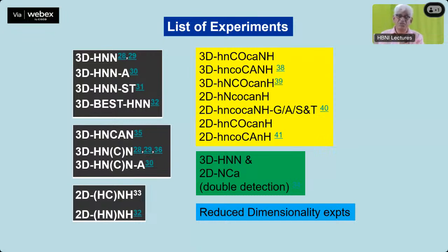That is why we spent sufficient effort in the previous set of lectures where we talked about the product operator formalism, how the various pulse sequences have to be analyzed, taking into account the transfer of magnetization pathways. And it's very easy to calculate all of these things, and many of these designs have been made by the students. So it is fairly straightforward, and you get extremely good spectra and very rapidly.